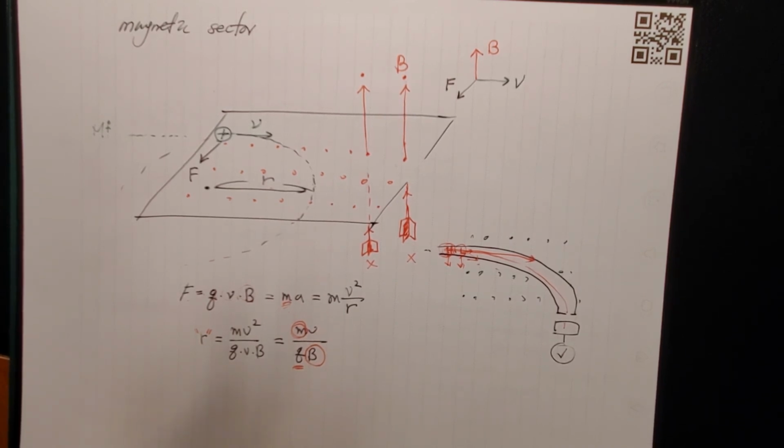While they're flying, you give some force to them using magnetic field or electric field, have them turn, oscillate, move back and forth, spin around in a tiny cup or space, and then you have them make a bigger motion or smaller motion, so you can control which mass is able to reach the detector.